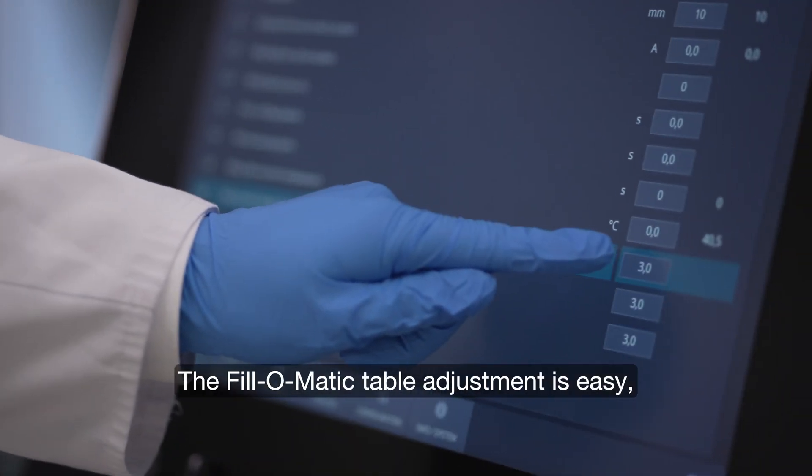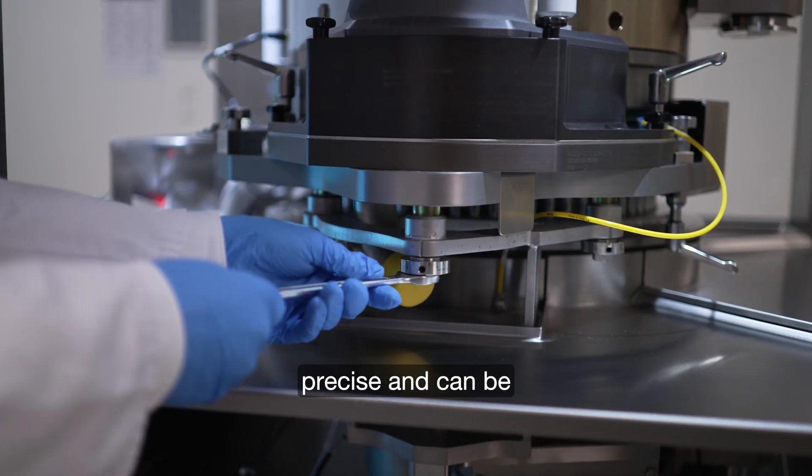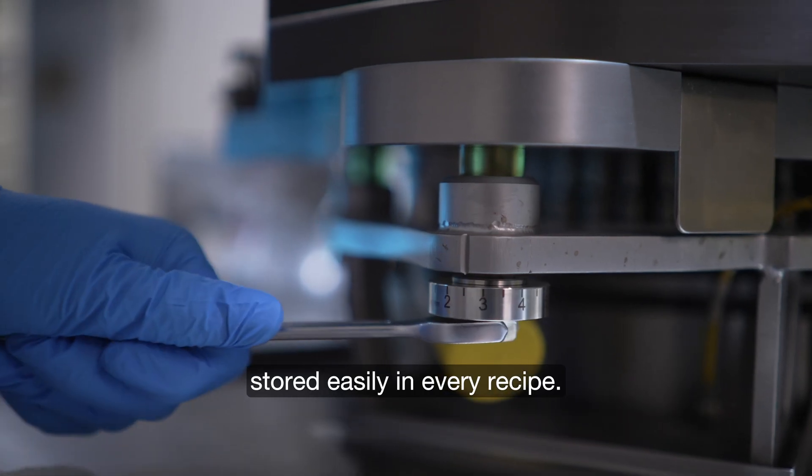The Fill-O-Matic table adjustment is easy, precise and can be stored easily in every recipe.